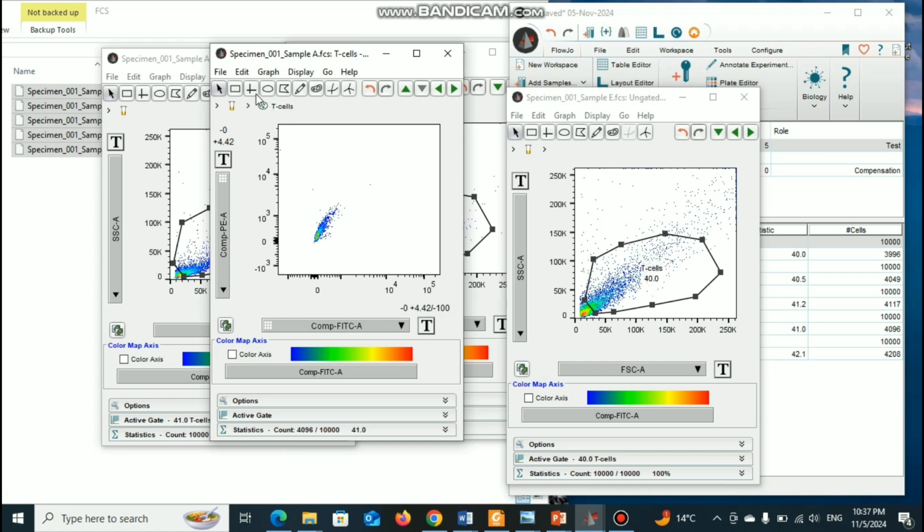So now I can choose the quadrant. So these are the negative control. So based on the negative control, that population, I need to select the gating. So here you can see that this is the negative control. So this is the 10 to the power 3. So less than 10 to the power 3 are the negative control. So in y and x axis, both I can use this 10 to the power 3 according to that. So I can select this gating.